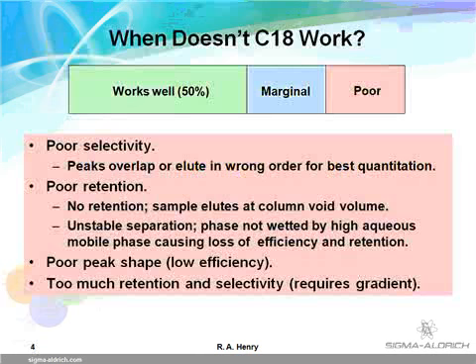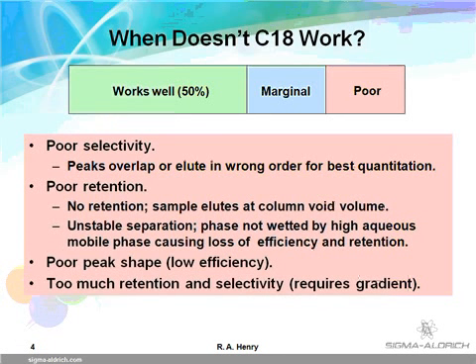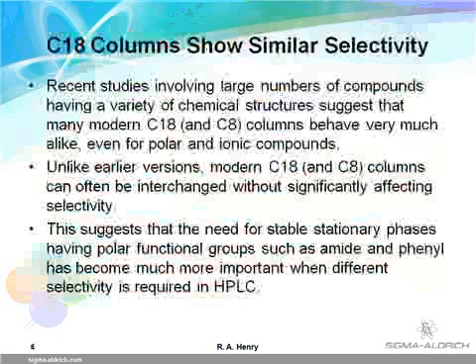The hydrophobic interaction forces that are dispersive in nature are often sufficient to allow C8 and C18 columns to retain and separate many organic compounds. However, results may not be optimum in all cases. Trial and error has shown that selectivity, retention, and efficiency can all suffer with certain sample types. In these cases, which occur as much as 25 to 50% of the time, polar RP phases should be explored.